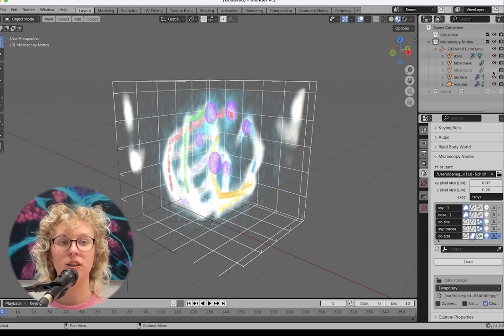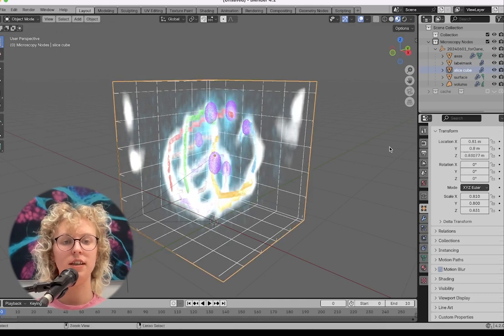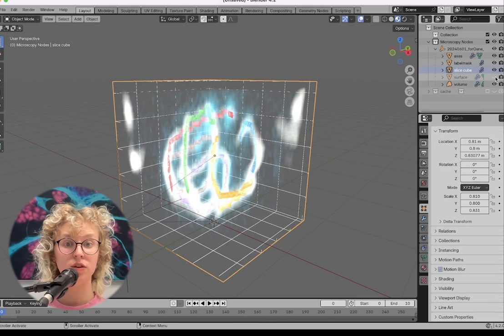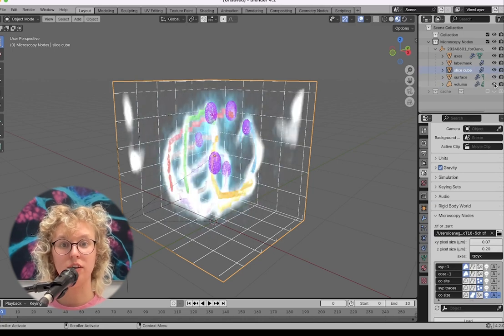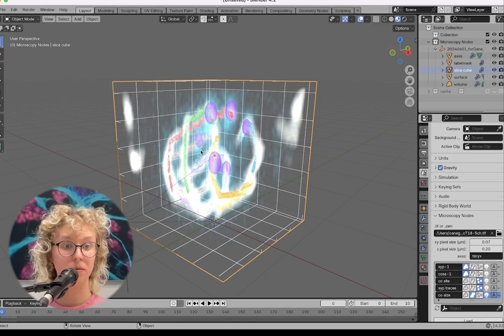The slice cube, which doesn't do anything but does allow you to slice the data if you move it. The surfaces, which here were these ISO surfaces, which were the CO sites. And the volumetric data, which is two colors, white and cyan, for the CO sites themselves.